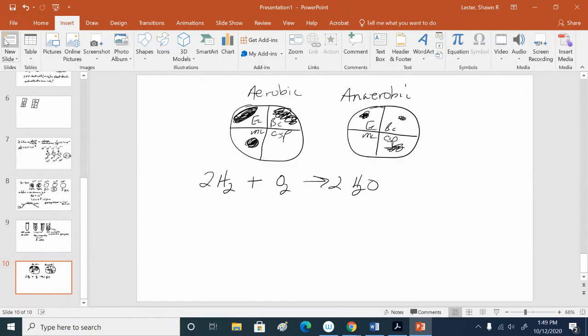Now, how do we verify that we created the anaerobic environment? If you see water, well, remember the agar is mostly water, and you have it in a sealed container at 37 degrees, so you probably see some condensation anyway. But how do we know for sure?